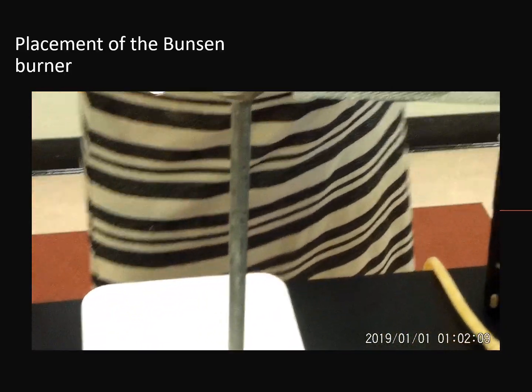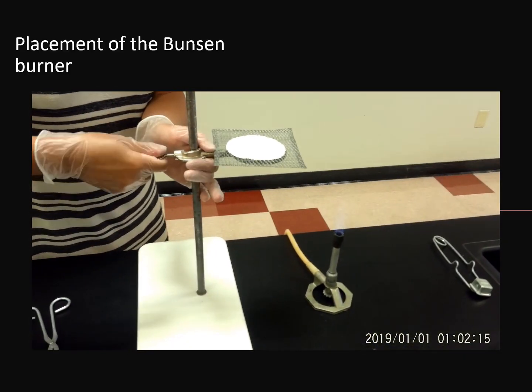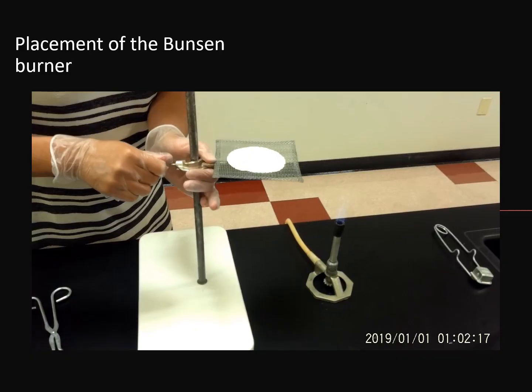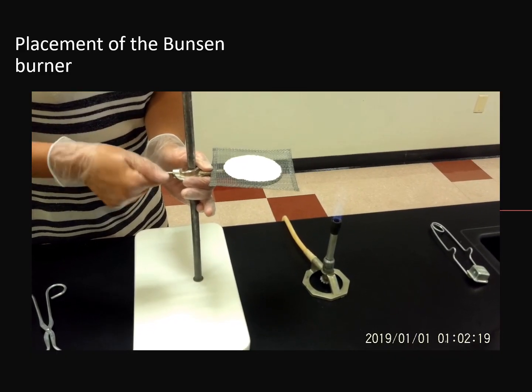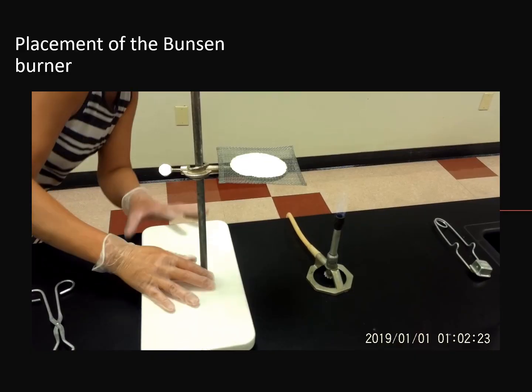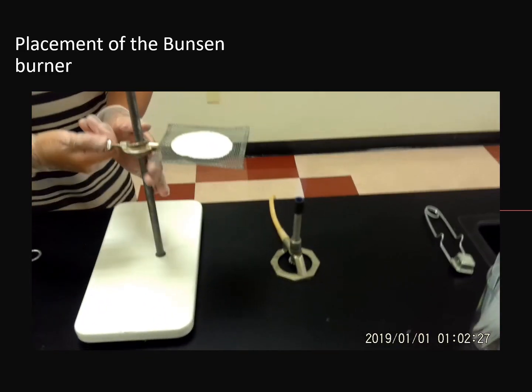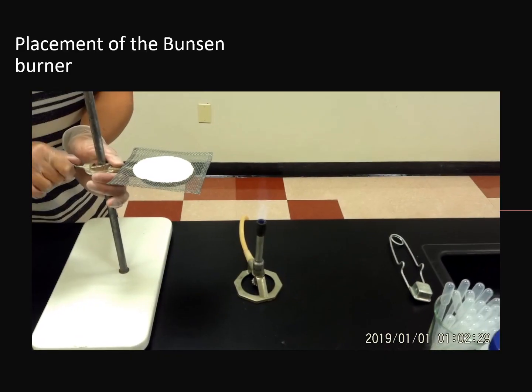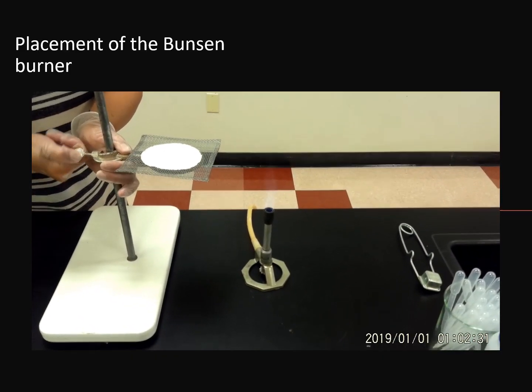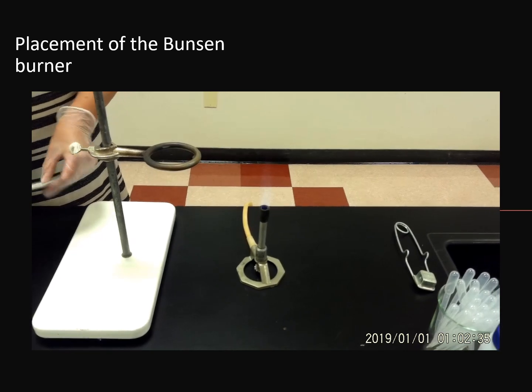Instead of adjusting when you're near the flame, you're going to adjust it slowly, moving it down until you're right where you want to be. Okay, so that looks good. Maybe a little lower.